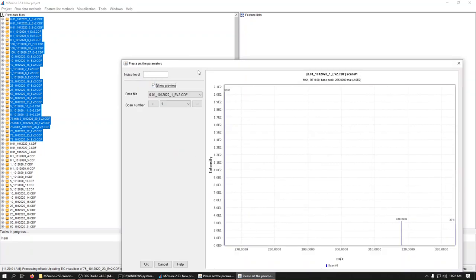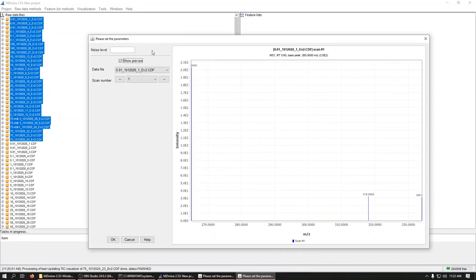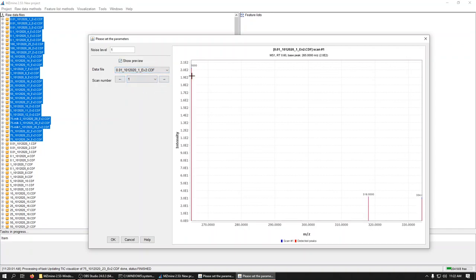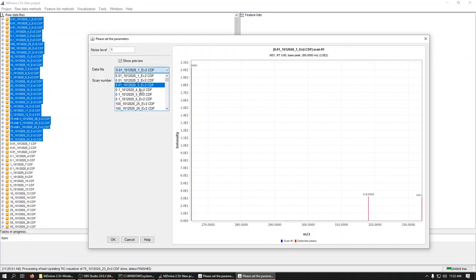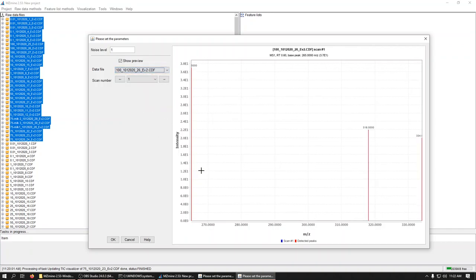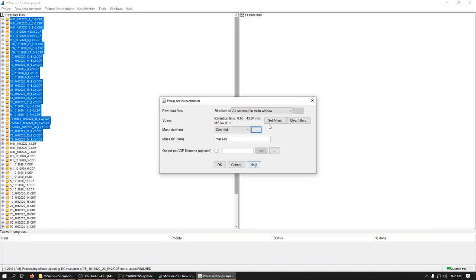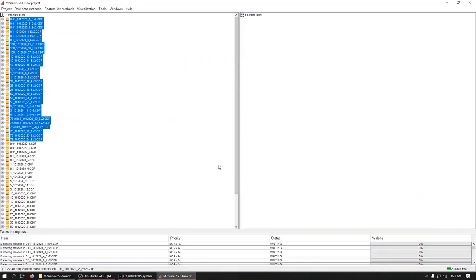So with single ion monitoring, we don't have a whole lot of noise signal. Because we picked three really strong peaks. So we can even set the level at one. And you see the peaks are now highlighted in red. And you can double check that across a different file. Everybody's picked. Okay. And then we say okay.